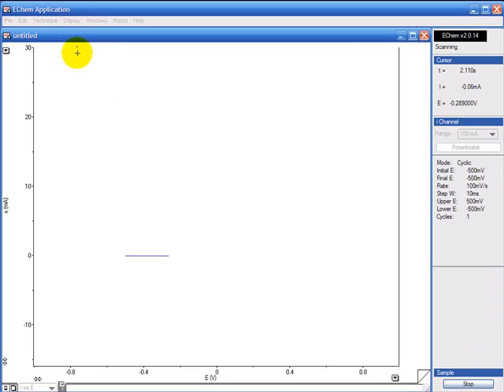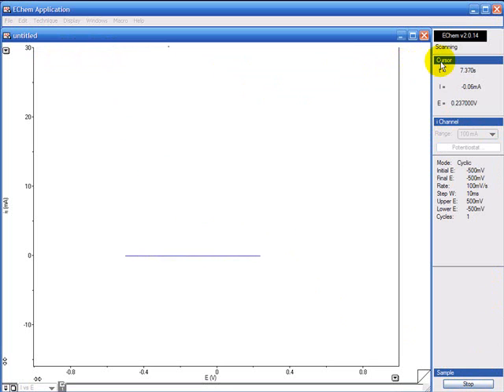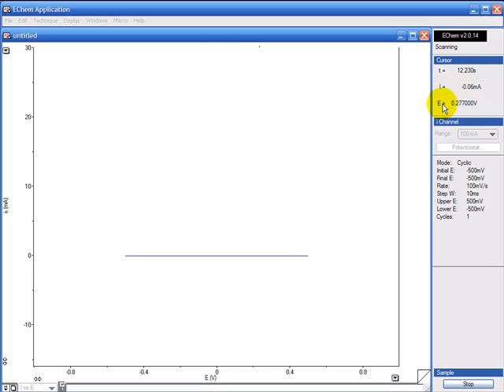This tick is moving across the screen and when it reaches the end it will be finished. At all times the software is displaying the time in here, the current and the voltage here.